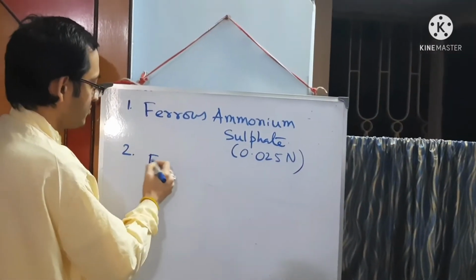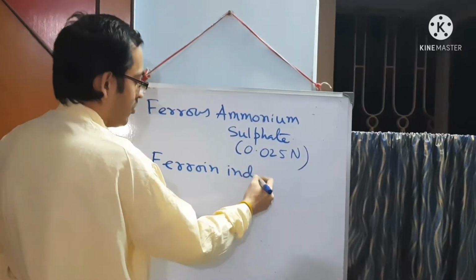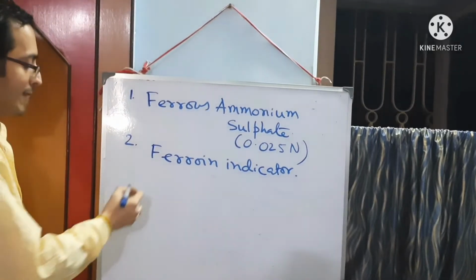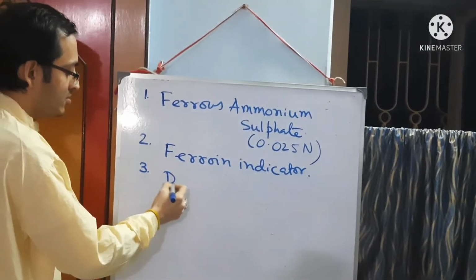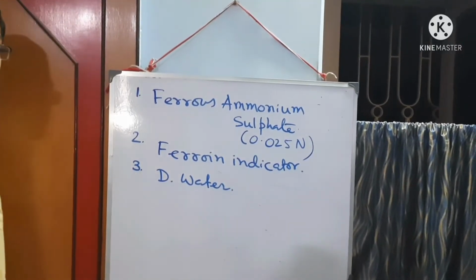Next, ferroin indicator. Next, distilled water.